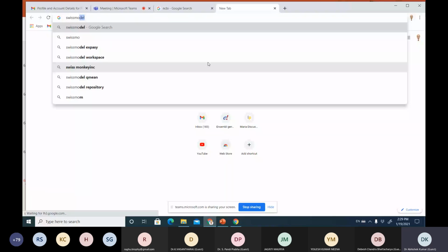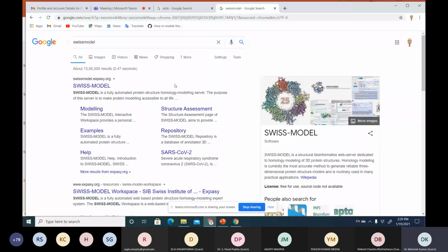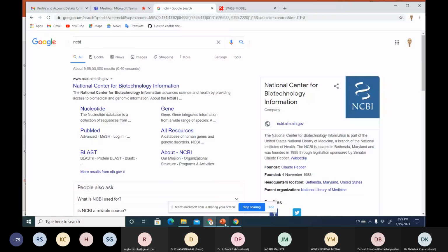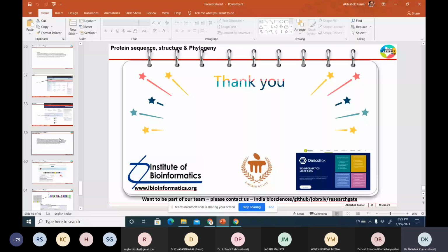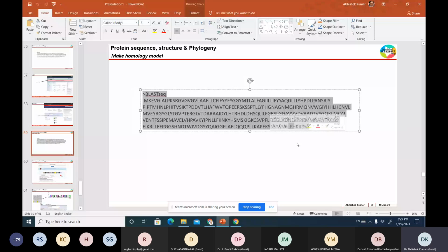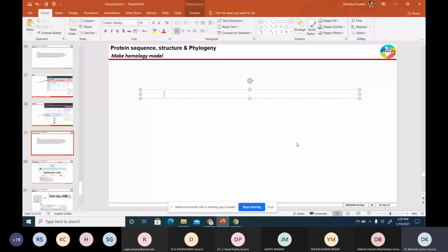So the first thing is that you get a protein sequence. I got a protein sequence, which I have put in a file. I only know the name, so nobody knows. I mean, I know because I collected it. So I say, just blast this sequence, and I'm copying it, and I can give it to you in the chat also, so you can also practice if you have.